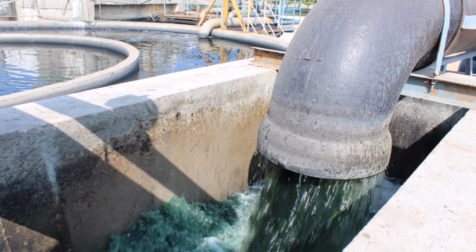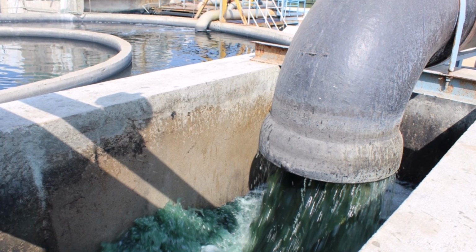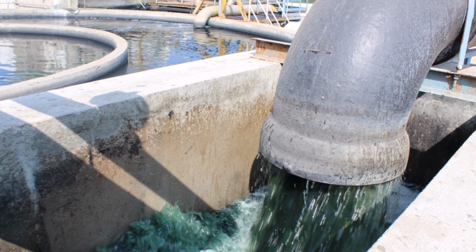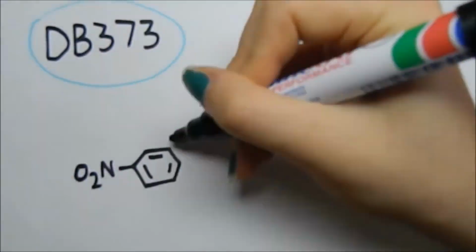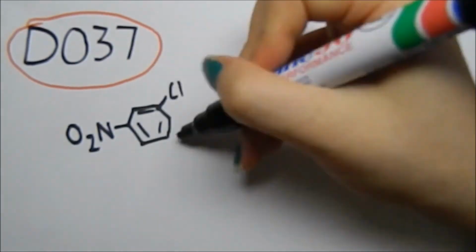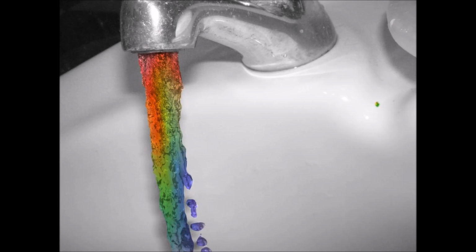With the analytical method described, it was determined that the water cleaning process was not efficient at removing the mutagenic dyes from the river system. However, this new method of using HPLC coupled with a diode array detector was deemed to be efficient for the monitoring of the 3 dispersed mutagenic dyes within the tested area, resulting from the textiles manufacturing effluent.